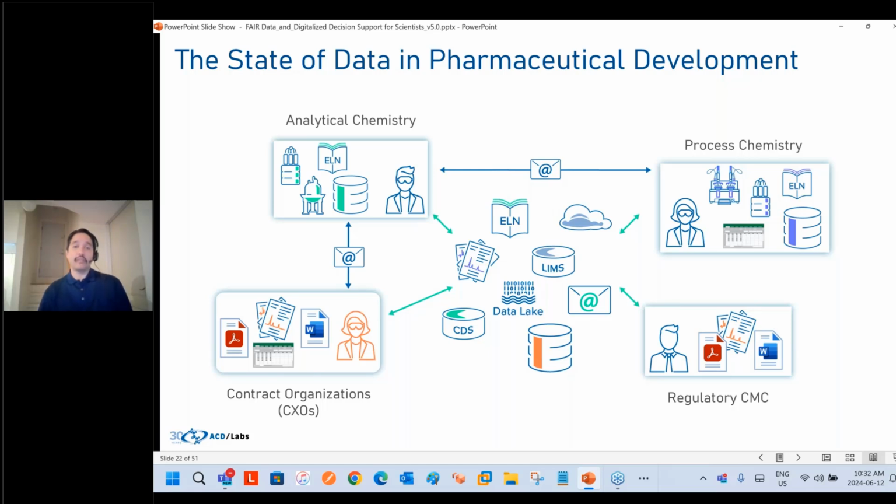Now, again, on top of this, if you're talking to a contract lab, this becomes even more difficult. Within that contract lab, they may have PDFs, they may have their results in a different format, and what this leads to is week-to-week meetings, trying to understand data. So again, that practice of being able to really share knowledge becomes quite crucial to collaborate.